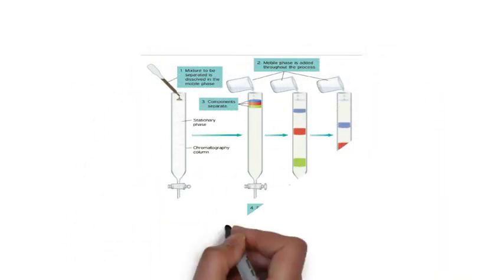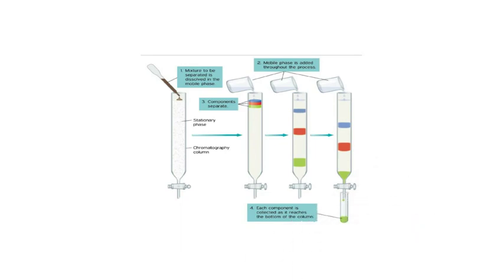Mobile phase and stationary phase are the two components of chromatography. After applying the sample, solvent is to be added, and after addition of solvent, compounds get separated according to their affinity. Now you can see in that last test tube we are seeing that green color compound. It has been eluted out. So similarly, other compound components according to the affinity will be eluted. This is called column chromatography.